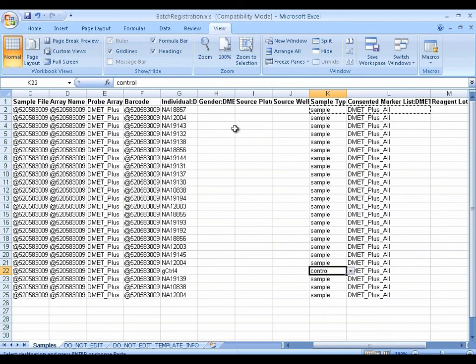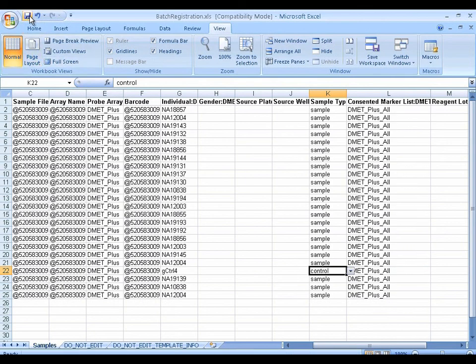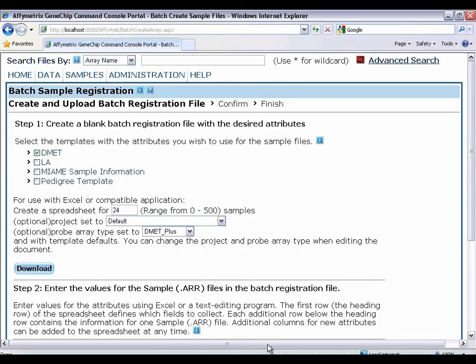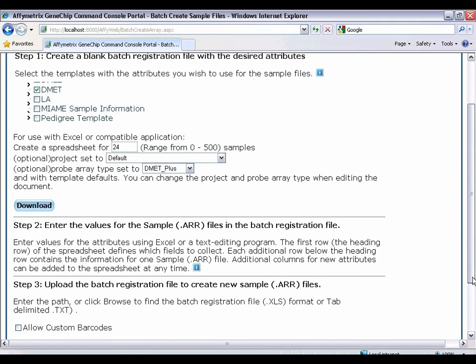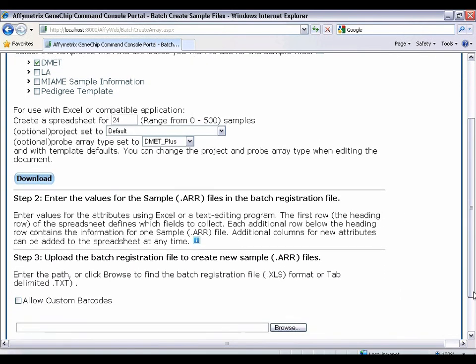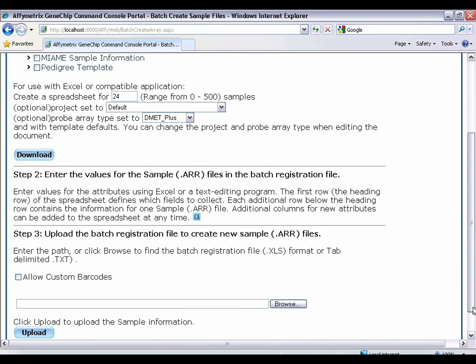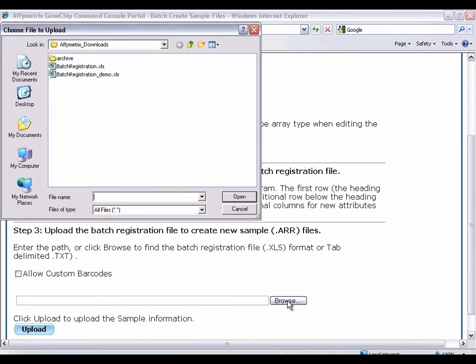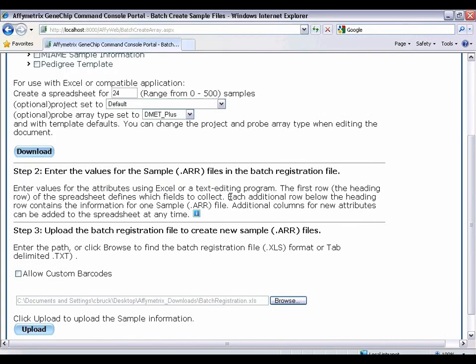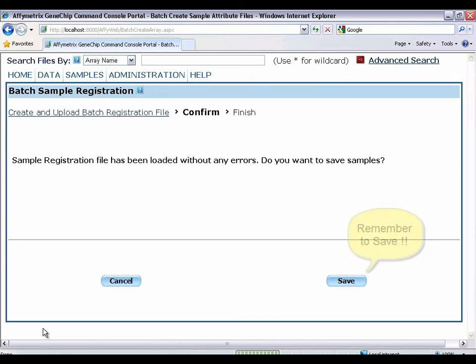So now that I've entered the information, let me save it. Batch registration window. And do step three. Upload the batch registration file. That's the one I just created. Upload. There have been no errors. Do I want to save samples? Yes.